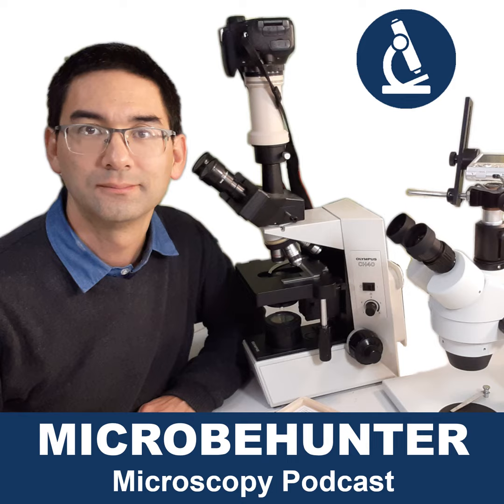Okay, if you want to say it in a negative way, you're kind of dependent on the microscope manufacturers if you want to upgrade your microscope. In the past, with a 160mm system, you just went to any no-name manufacturer and you basically got yourself an objective, and it worked. That's not possible with the infinity optics anymore because it's proprietary to the manufacturer, and every manufacturer defines its own standard.